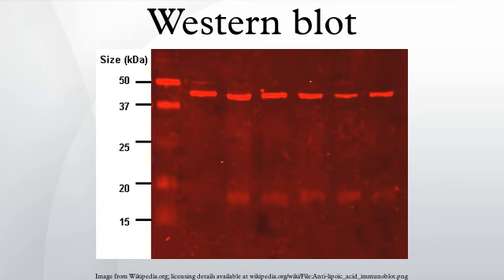This is known as a secondary antibody, and due to its targeting properties, tends to be referred to as anti-mouse, anti-goat, etc. The secondary antibody is usually linked to biotin or to a reporter enzyme such as alkaline phosphatase or horseradish peroxidase. This means that several secondary antibodies will bind to one primary antibody and enhance the signal.